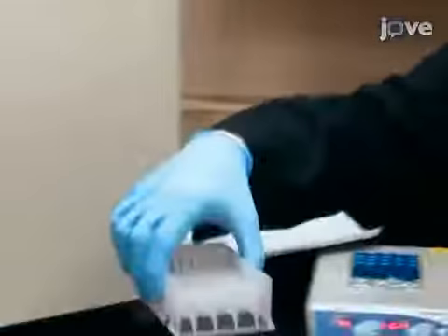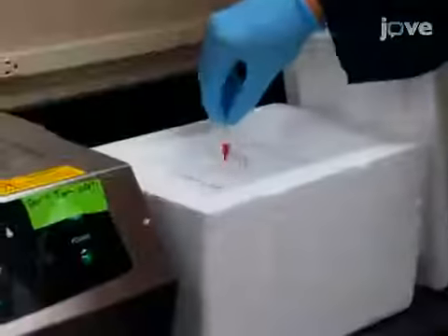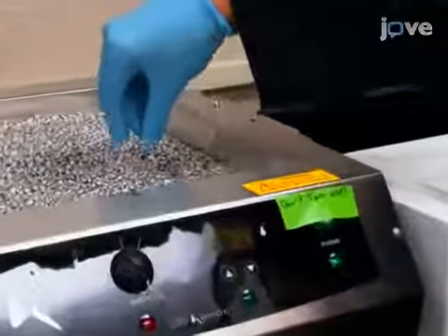After the 3rd cycle, place all of the tubes in an ice bucket protected from light. Then incubate the tubes for 10, 20, or 40 minutes in a 37 degrees Celsius bead bath, starting with the 40-minute tube.